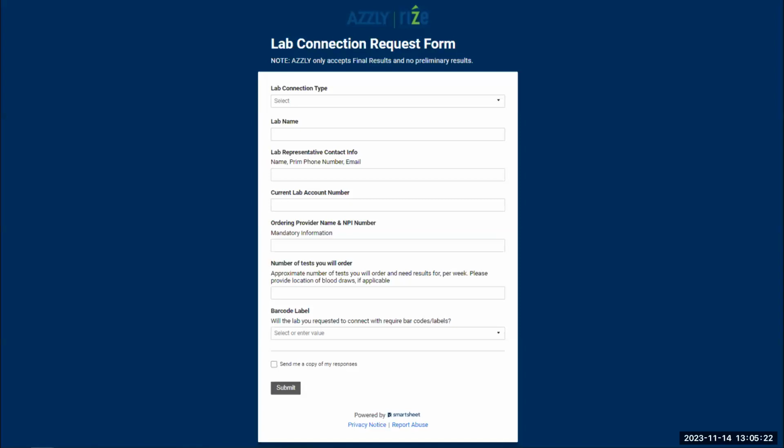But we'd like to, with you all hands up on this, if we could move forward in getting this into production so we could roll it out to the end users. Obviously, we will support it. We'll make sure that they've got PDFs, the e-learning is updated with the how-tos to do this. But we'd like to get this out, if we could, in a production release this Friday evening. Make sure that everything tests accordingly over the weekend, and then support any bidirectional questions that might come up next week.